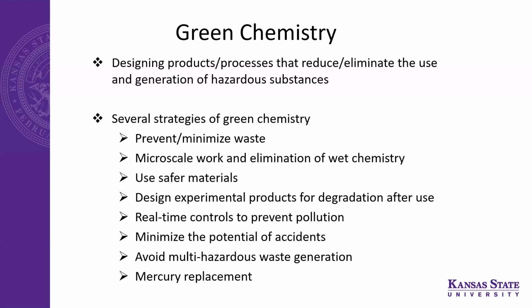And so long term, also, if you have grants, you have funding, you're setting up a new lab, try to do those without the mercury-containing devices. Always, yes. And I'm catching Brandon off guard here, but we're looking at how many in the past we've also gotten rid of, disposal cost, and trying to present that to management on why that's a good idea. And I think you'll see something in 2024.